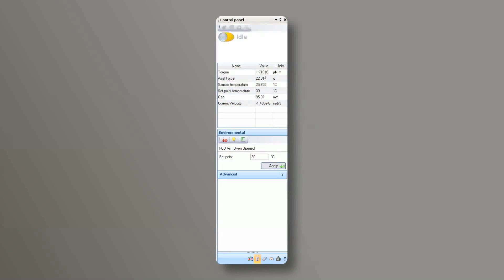Before installing the torsion tools, go to the control panel and select the appropriate torque range, torque transducer, and normal force mode. These are typically FRT high range for the torque and spring mode for the normal force.